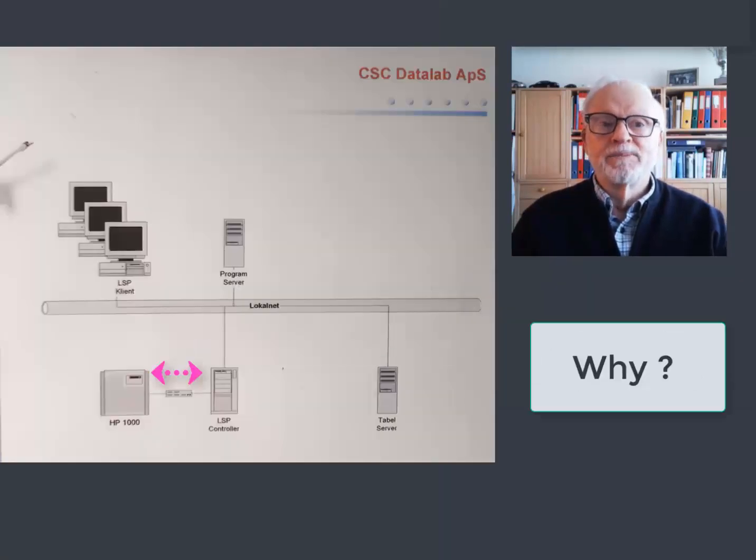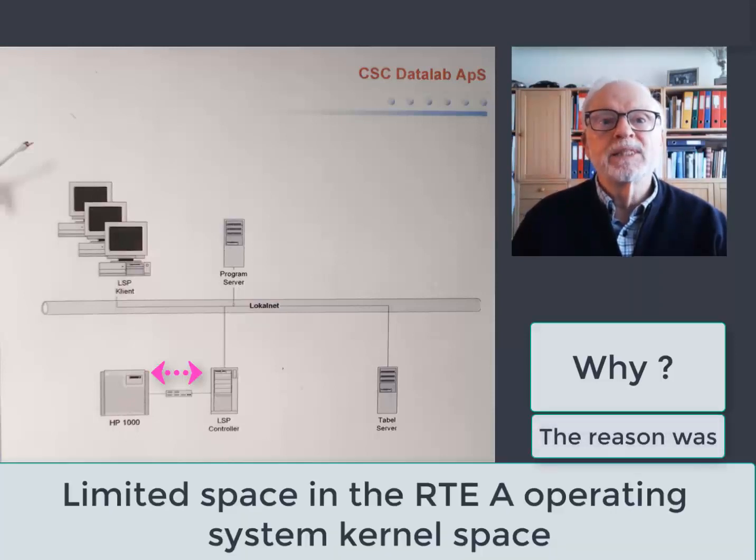You may ask, why not communicate via network card from the HP 1000 to the front-end computer PS2? It was a problem on the HP 1000 to insert advanced driver net software into the actual HP 1000 RTE-A core area, which was already well filled with software, drivers, many driver tables, ID segments, etc. Thus, when the core area was filled, there was only room for 187 ID segments, tables that determine how many programs in the operating system can be handled at once, and we wanted no significant reduction of this number.